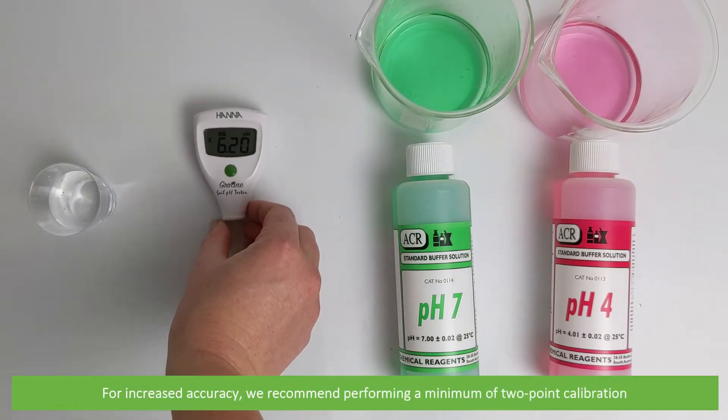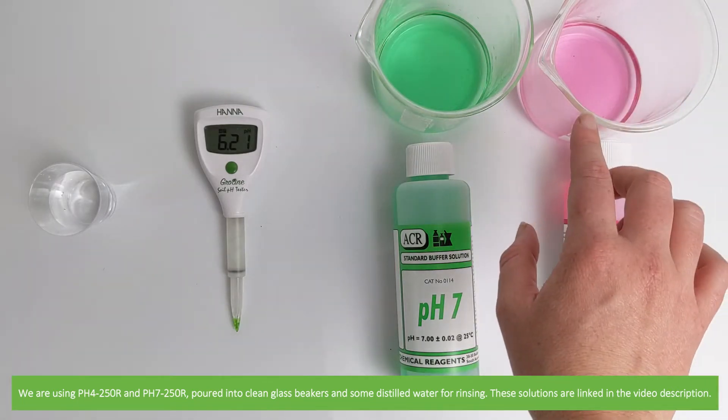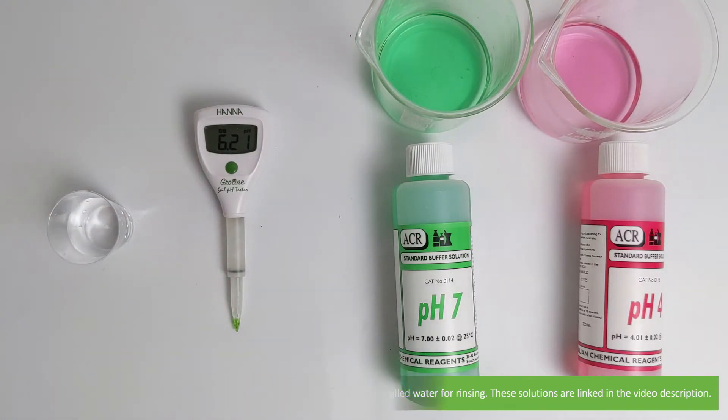For increased accuracy we recommend performing a minimum of a two-point calibration. For this calibration we are calibrating to pH 4 and pH 7. We're using pH 4 250R and pH 7 250R poured into clean glass beakers and some distilled water for rinsing. These solutions are linked in the video description.